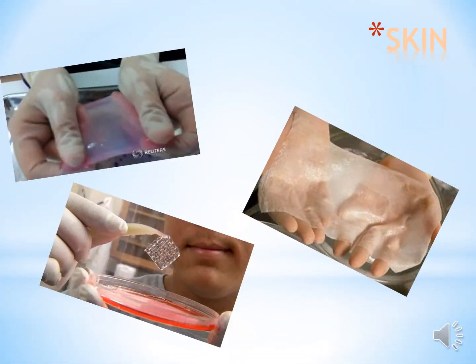Skin. Imagine the uses that printing skin grafts could have for burn victims, skin cancer patients, and other kinds of afflictions and diseases that affect the epidermis. Medical engineers in Germany have been developing skin cell bioprinting since 2010, and researcher James Yoo from Wake Forest Institute is developing skin graft printing that can be applied directly onto burn victims.